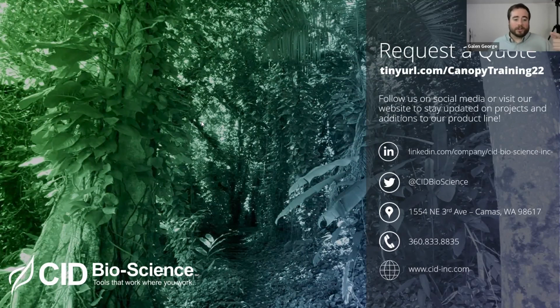Also, this is going to kind of loop into the next question as well. The neutral density filters, that's the word I'm looking for, that we include are also good for this purpose. Just like with any other normal photography, if you have way too bright of direct light, you can use neutral density filters to help eliminate the potential oversaturation of light, the physical filter that goes into the actual camera itself.